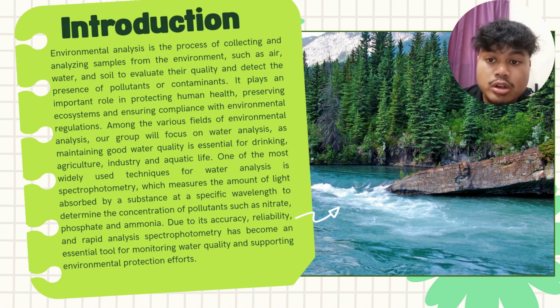Among the various fields of environmental analysis, our group will focus on water analysis, as maintaining good water quality is essential for drinking, agriculture, industry, and aquatic life. One of the most widely used techniques for water analysis is spectrophotometry, which measures the amount of light absorbed by a substance at a specific wavelength to determine the concentration of pollutants such as nitrate, phosphate, and ammonia.